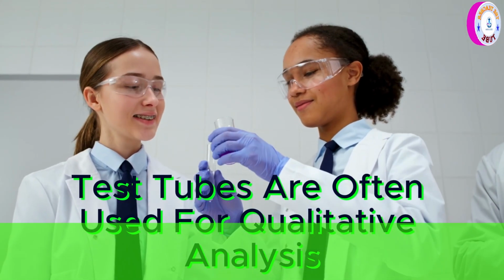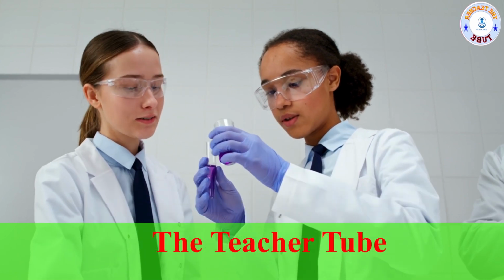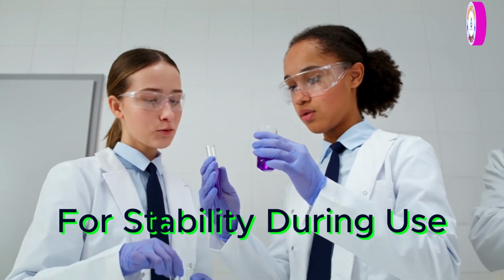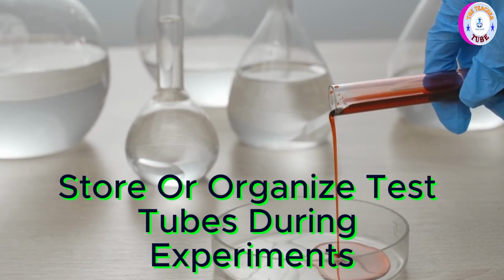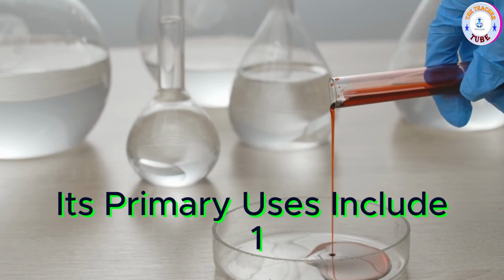They are used to hold liquids, solutions, or small samples that might need to be tested, studied, or analyzed. Test tubes are often used for qualitative analysis and experiments that require quick, small-scale tests or reactions. They are typically held in a test tube rack for stability during use. A test tube rack is a piece of laboratory equipment used to hold, store, or organize test tubes during experiments. Its primary uses include: 1.